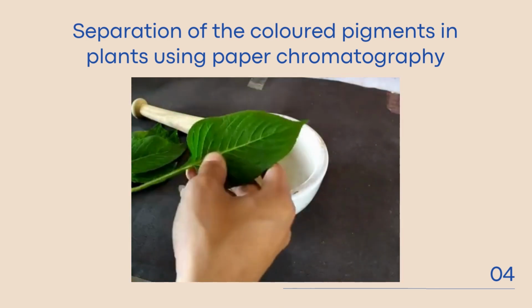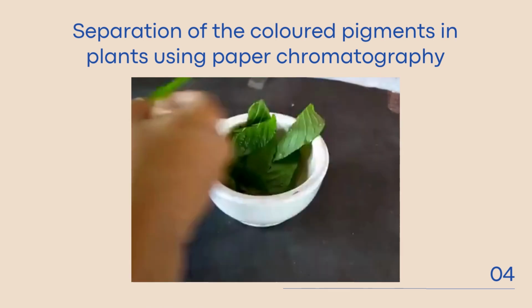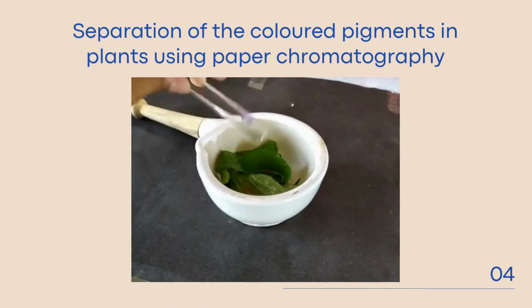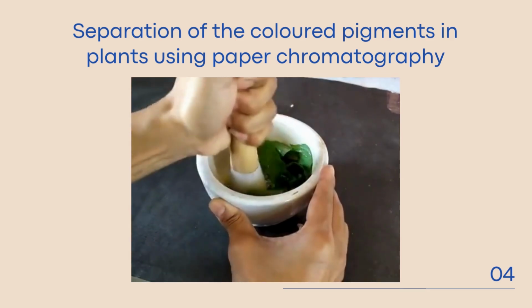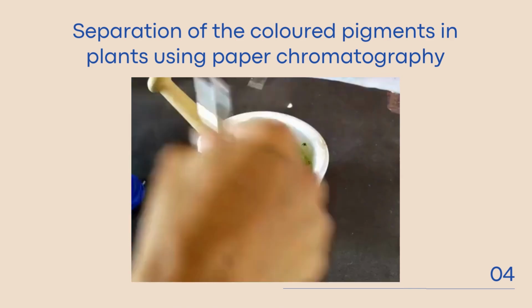To begin the experiment, take 2 to 4 fresh green leaves. Discard the midrib and grind the rest in a small amount of acetone petroleum ether solvent mixture along with some clean pre-washed fine sand to aid in the grinding process. Add more solvent if required.